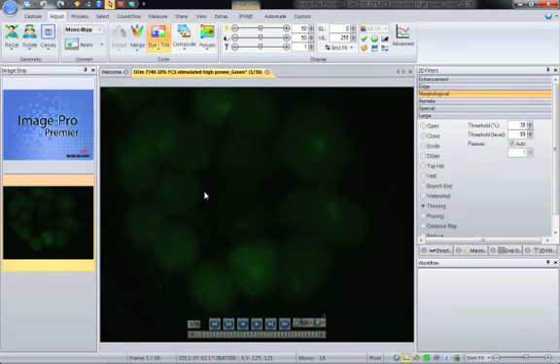Hi, this is David from MediaCybernetics and in this quick review we will be showing you how to do intensity track measurements in ImagePro Premiere.